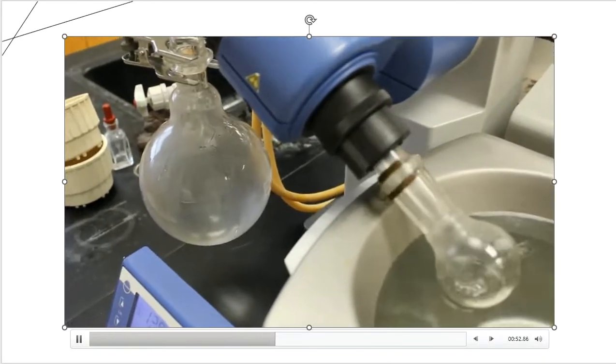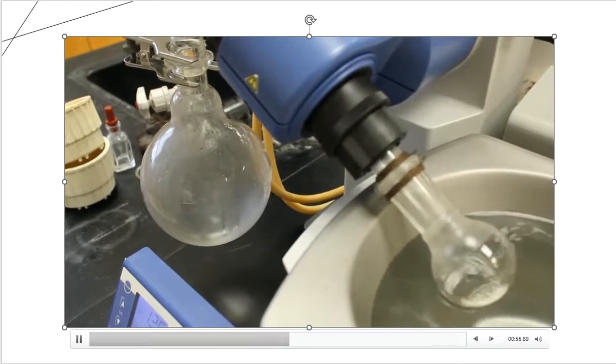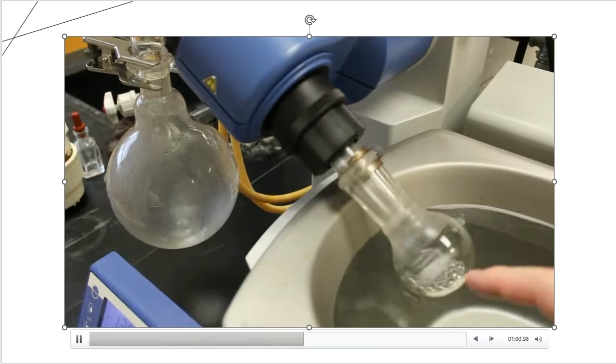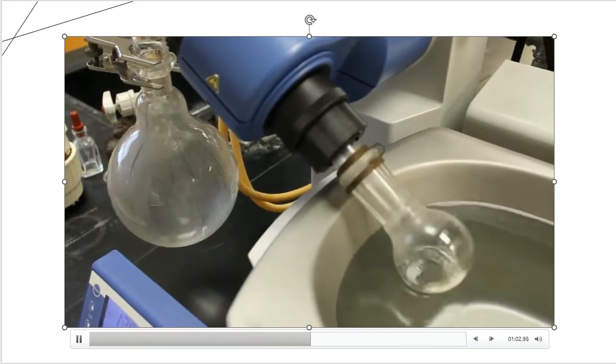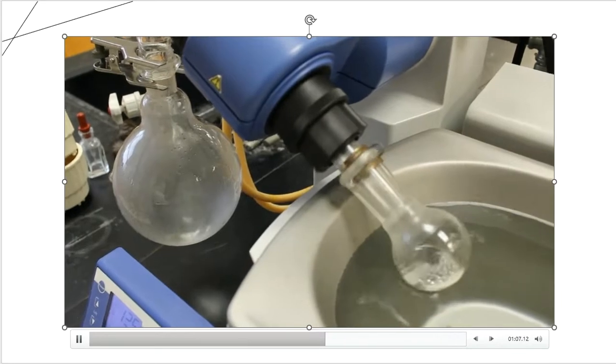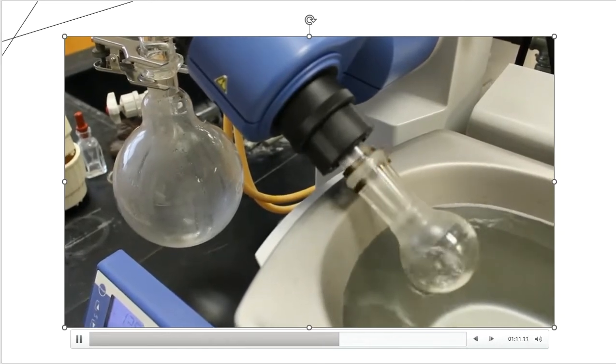That's kind of the purpose of a rotary evaporator. That's exactly what I want to see, and it looks pretty good. Over here, you're seeing a little bit of bubble that's beginning to form, and that's a very good sign that methylene chloride is almost getting out and fully escaping. So I'm just going to continue to let it do this.